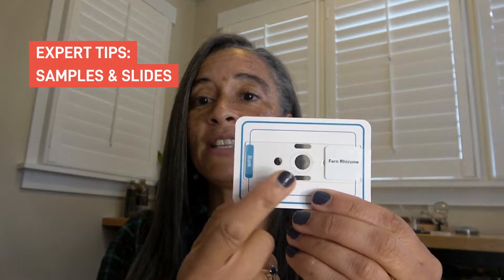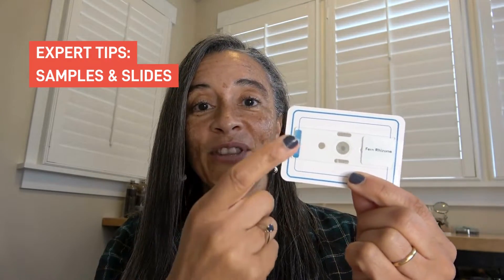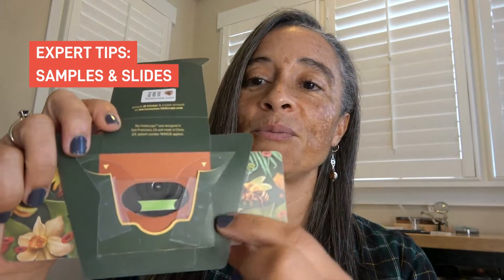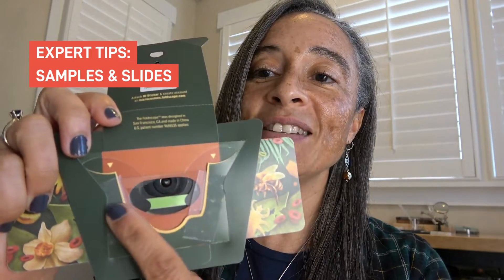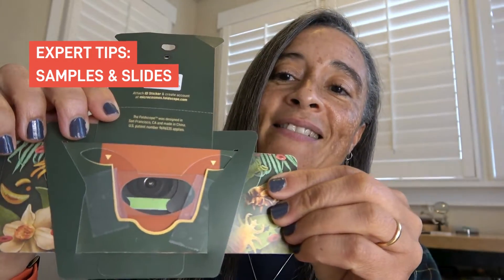One thing you can do is take your glass slide and just tape it to a trading card. Then you can take the trading card with the glass slide on it, put it into your Foldscope 2.0, and view it as usual. Or you can put your slide into your Foldscope 2.0 and tape it directly to the Foldscope. That way, as you pan, your slide should go exactly where you want it to.